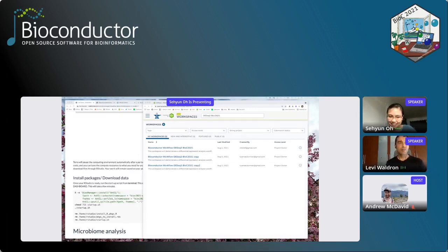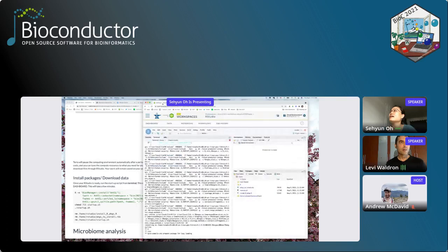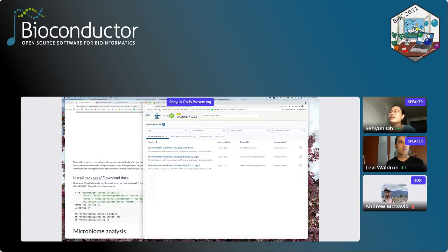There is, you didn't see it here, but you can create a custom environment with custom images, and then you could get any version of RStudio that you wanted. But if you're choosing one from the drop-down menu, it'll be what's available, and hopefully it's not lagging too far behind the current Bioconductor release.